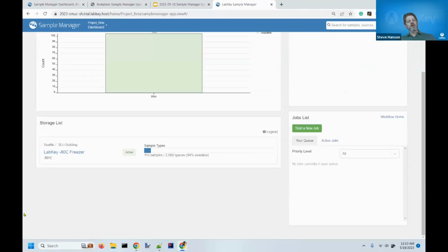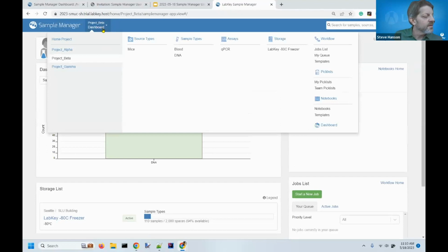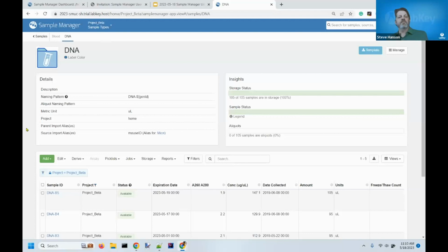Quickly, I'm going to do one thing more here, and that's take a look at workflow and assays. I'm going to do this so quickly, it's not even going to be worthy of the feature, but I want to leave time for some questions and answers here.